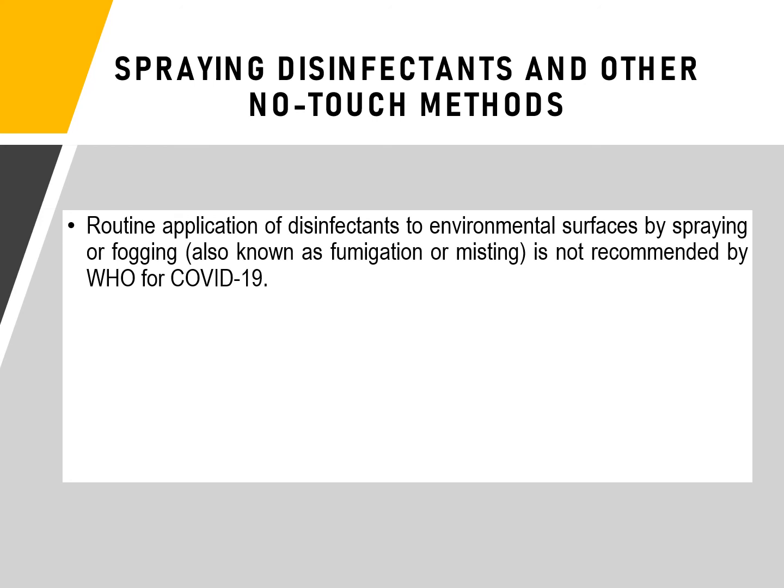It is ineffective in removing contaminants outside of direct spray zones, and aside from that, it can actually result in risks to the eyes, respiratory or skin irritation, bronchospasm due to inhalation, and gastrointestinal effects such as nausea and vomiting.